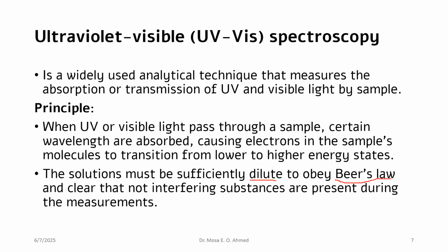Besides the dilution, we ensure that the solution is free from interfering substances, such as fractions or particles of silica that result from TLC purification of the solute, because the interfering substance may affect the absorption of UV light and then affect the response obtained by the UV detector.